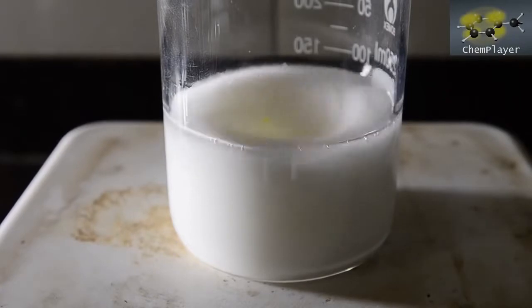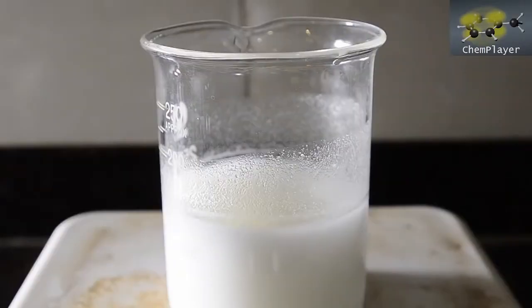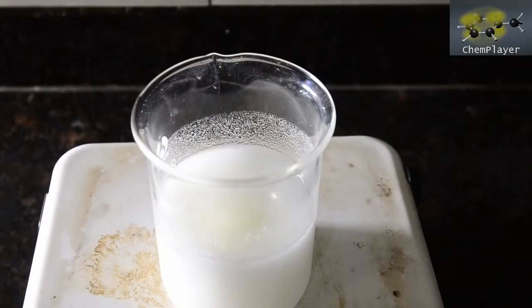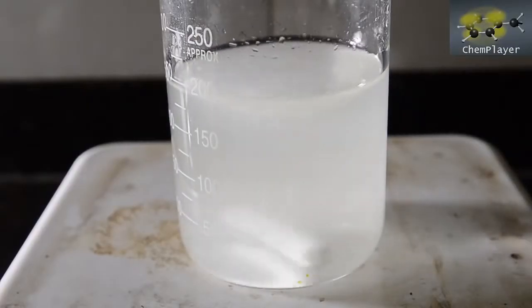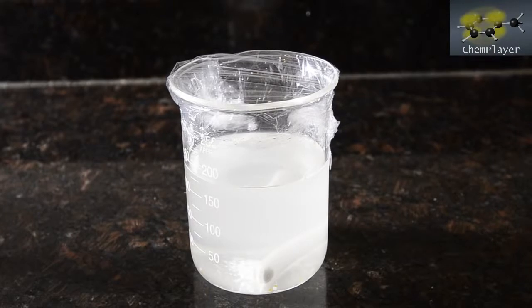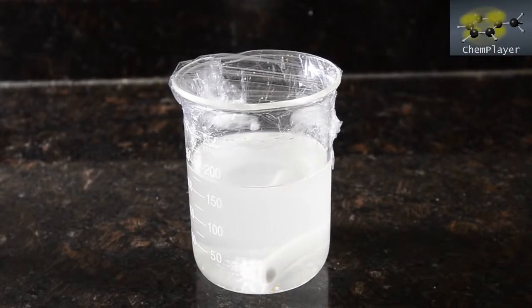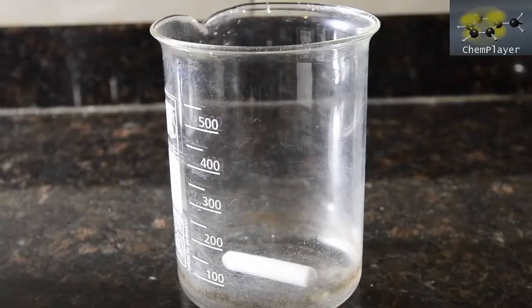We slowly added more water until we had a saturated cold solution. Nearly there. Okay, about 180 ml total volume. We chilled this down so it's nice and cool. Our reaction vessel is going to be this 600 ml beaker. We'll put a large stir bar in here.